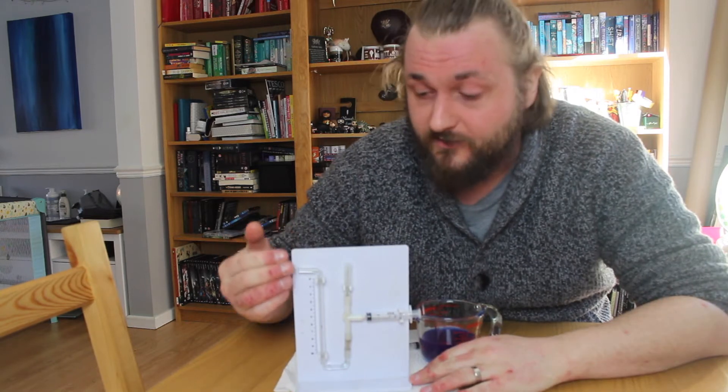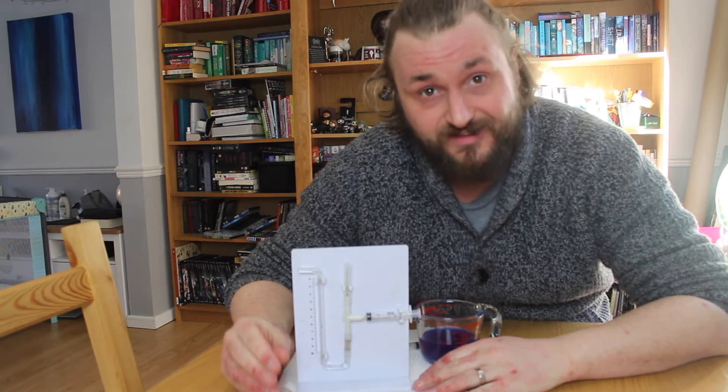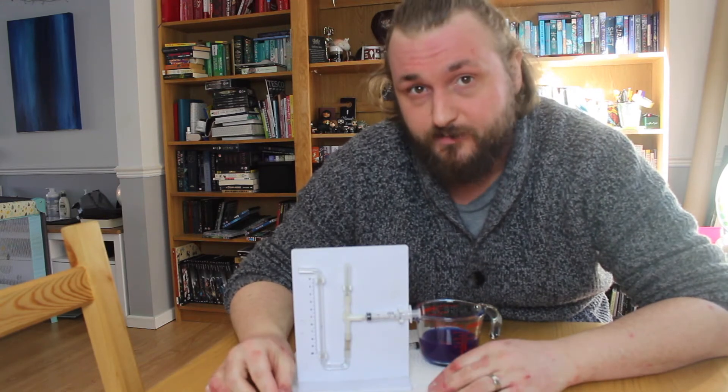What I'm going to go through today are the different parts of the potometer, how you can set it up, how you can then set it going to see the rate of transpiration for a plant, and then a few ways that you could change the conditions of the plant to alter the rate of transpiration.